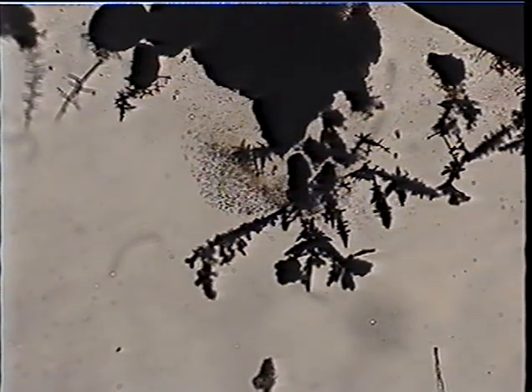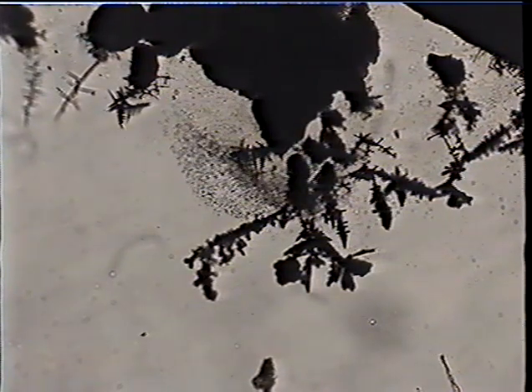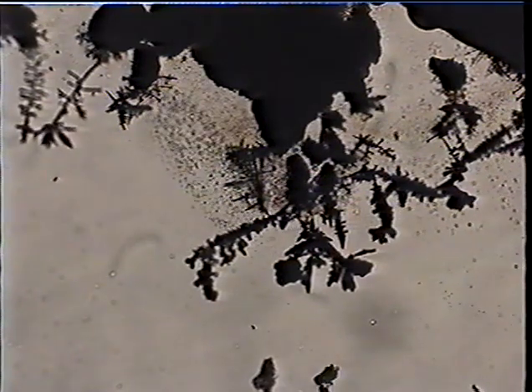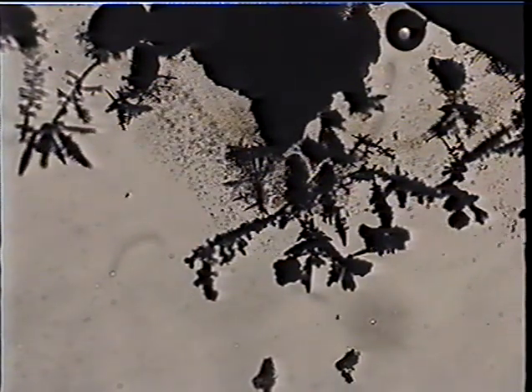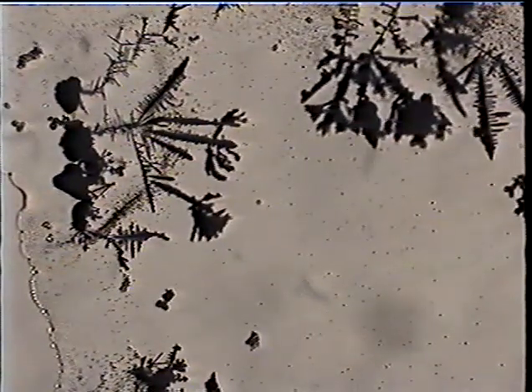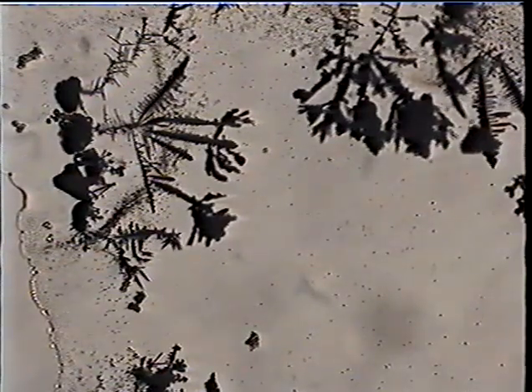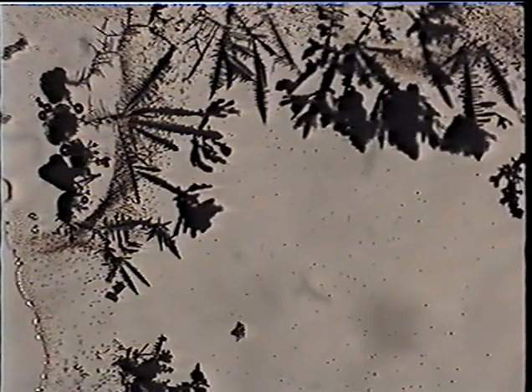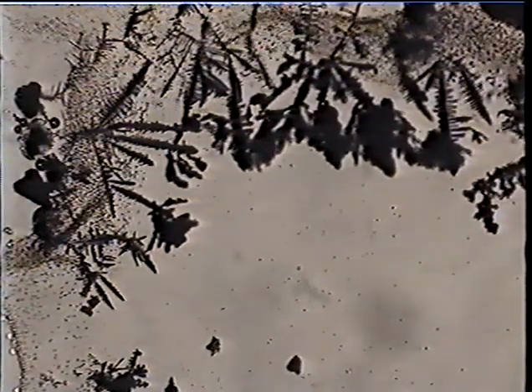The plume that you see there is lead carbonate, which is forming from the lead displaced from solution, reacting with the carbonate, the CO2, that dissolves in any droplet of water, since there's CO2 in the air. So here we see more dendrites of metallic lead. We can do this with copper, with silver, a number of different metals. We can do it with mercury, and we get little droplets of mercury instead of the dendrites, since it's a liquid material.